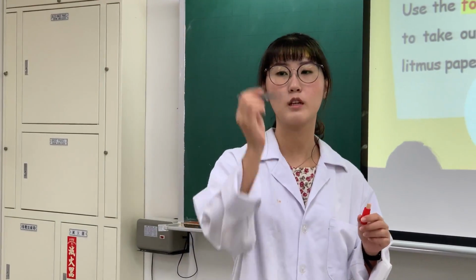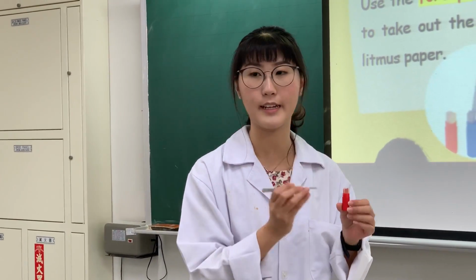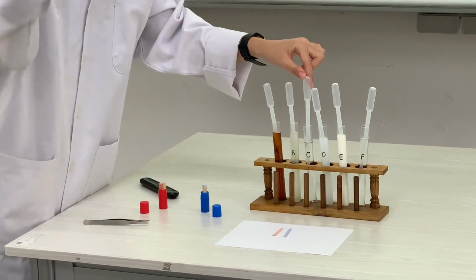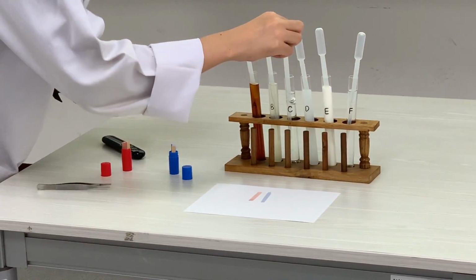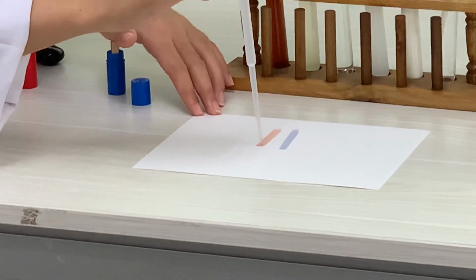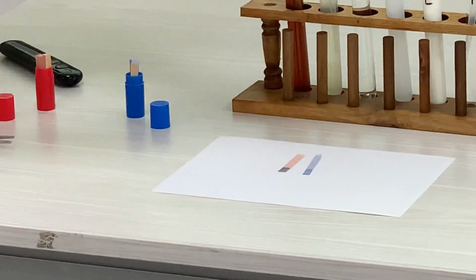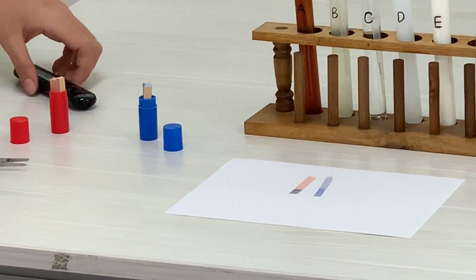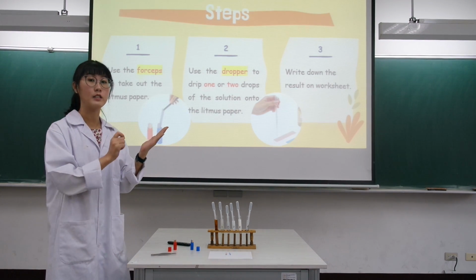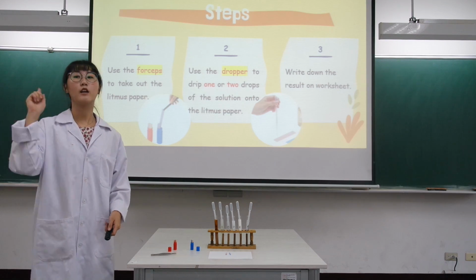Step 1. Remember to use the forceps because we want the litmus paper to be clean. 记得一定要用镊子，因为我们要保持石蕊试纸的干净。Step 2. We're going to use the dropper to drip 1 or 2 drops on the litmus paper. We're going to take the solution, use the dropper, and drip 1 or 2 drops on the litmus paper. Okay, and put it back to the test tube. Step 3. I want... Understand? Very good. So, 3, 2, 1, go!